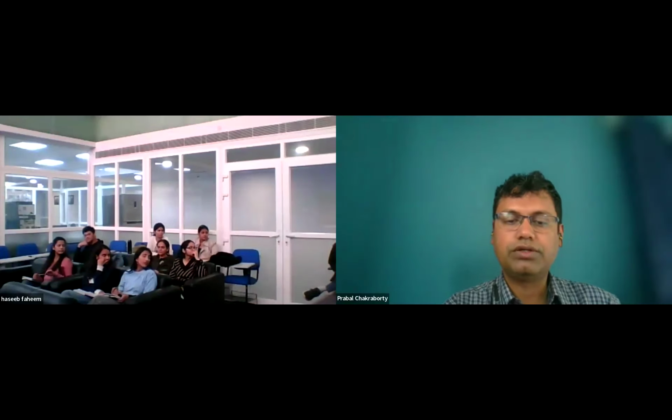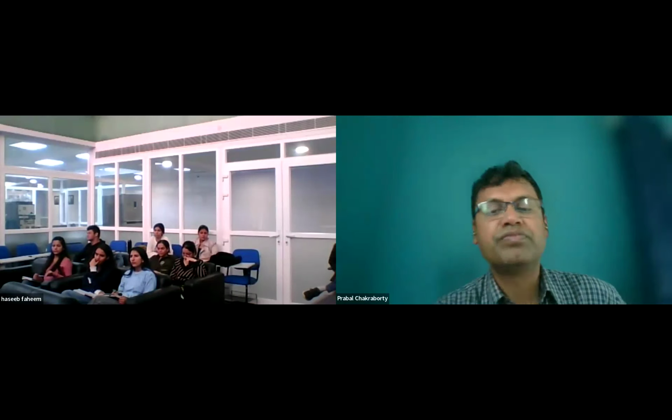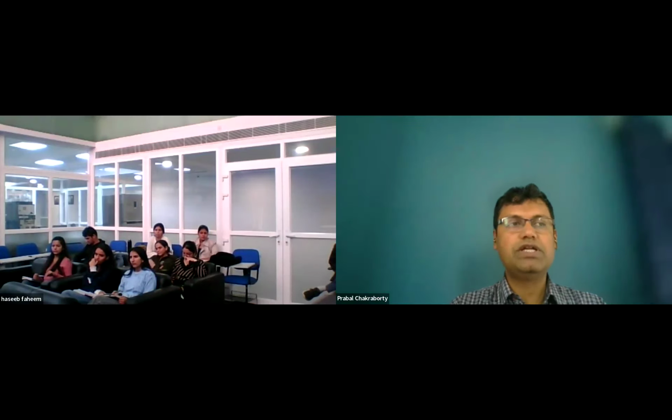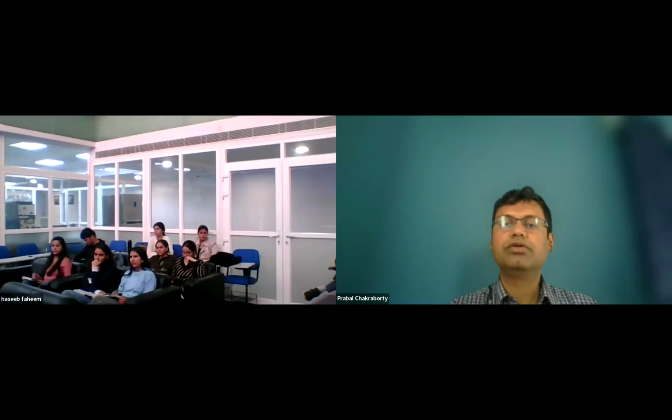Sorry, can all these AI be used as a plugin in analysis software? Can you repeat please? I'm asking whether all of these AI can be used as a plugin in Nikon software. Yes, yes. I don't know what the version of the software is. Generally, the denoise AI comes as a default, but the other AI functions you can always add as a module anytime. Okay, thank you. Thank you.